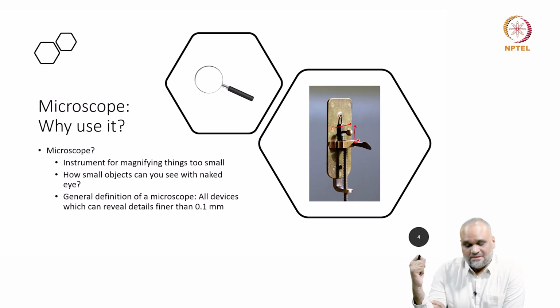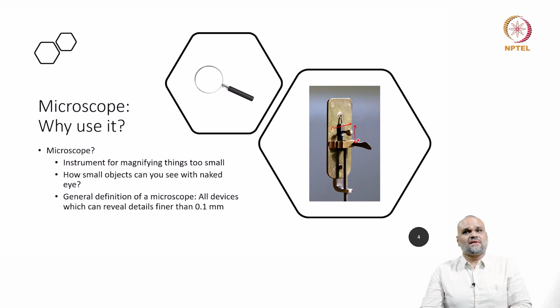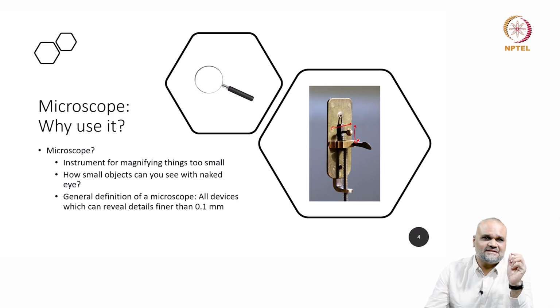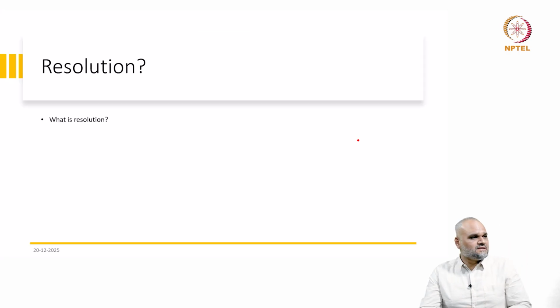Now, if I move further, there is something that I'm using called resolution. There's a term called resolution. I was telling you, any tool that aids you to resolve details finer than a naked eye. So what do I mean by resolve? That brings me to the question, what exactly is resolution?